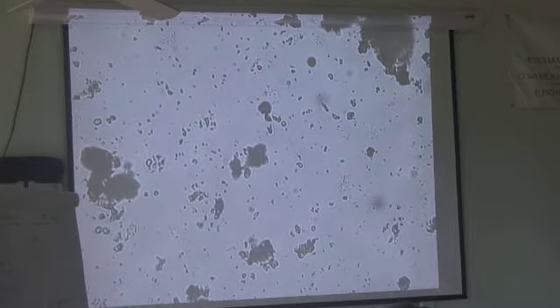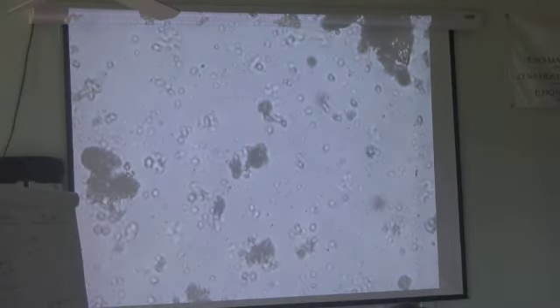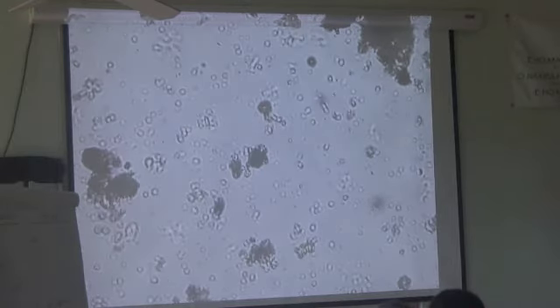I can't tell if this is a regular bacterium or an actino, so just ignore it. Searching through here, we've just got lots of bacteria. This is a fungal spore. There goes a flagellate.